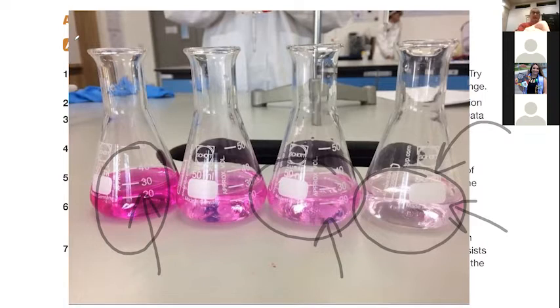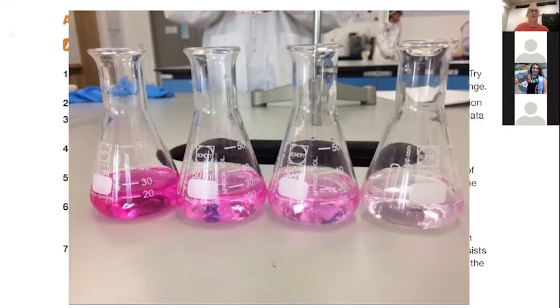So if your titrations all look like this, we want you to do this well, and doing it well means getting right up to the equivalence point and then just going barely past it. So once you're swirling and it takes a couple seconds for it to go, then we start adding drop by drop, just a little bit at a time, hopefully to get that pretty pink color.